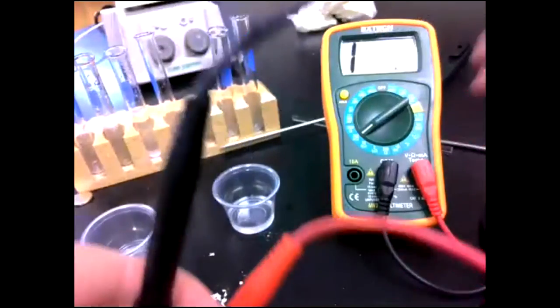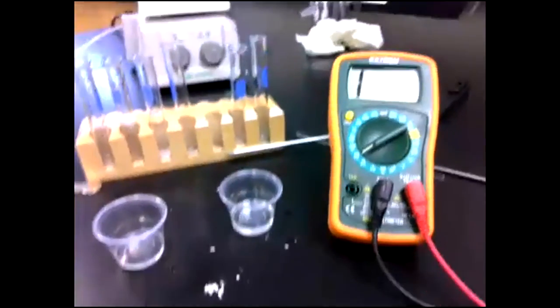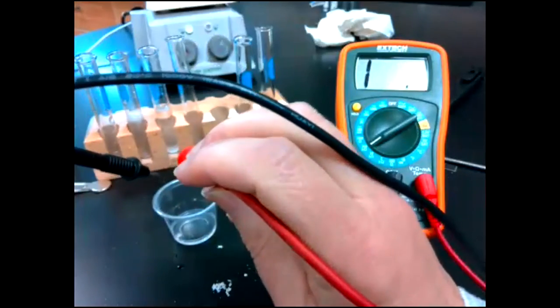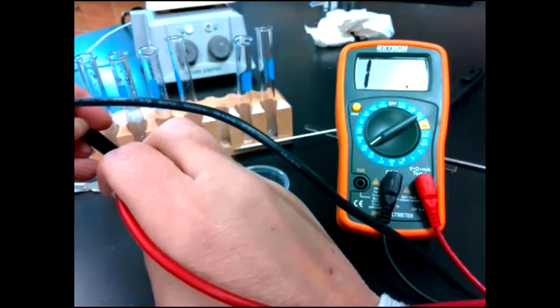And then I guess, can you see the numbers? It's awkward with the camera here. Let me just make it so you guys can see everything. So I'll put them both in. I want to put the probes together in the solution, but make sure that they're not touching each other. And then you're going to watch the numbers on the device.